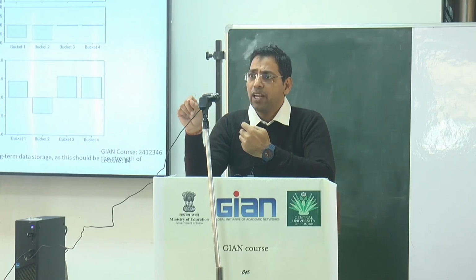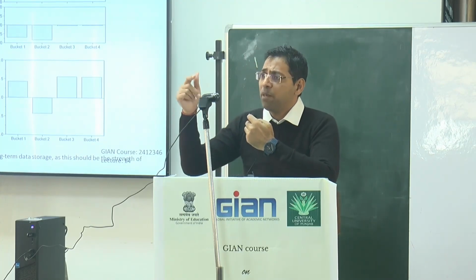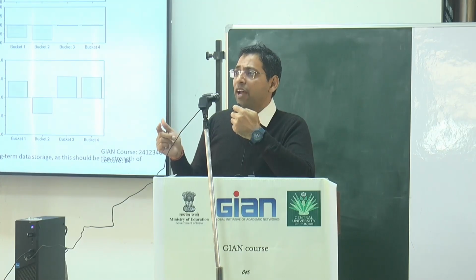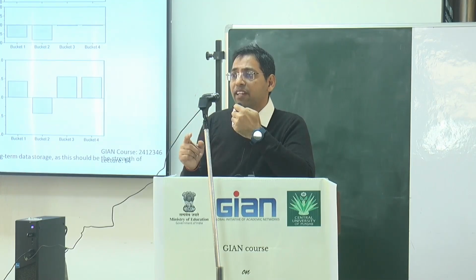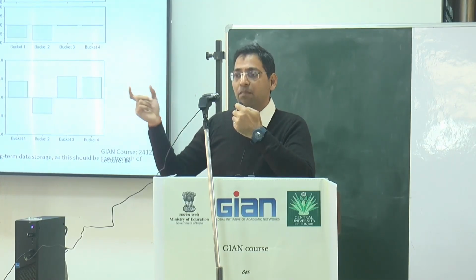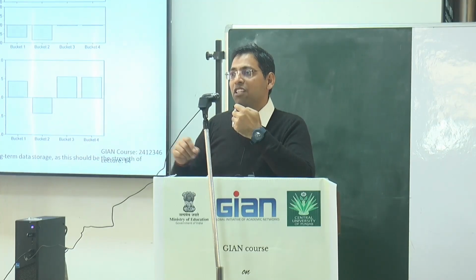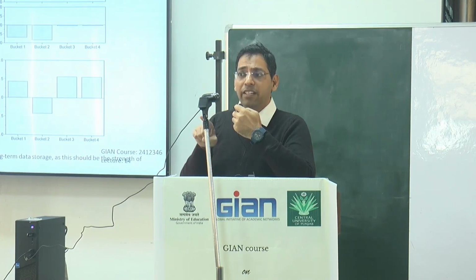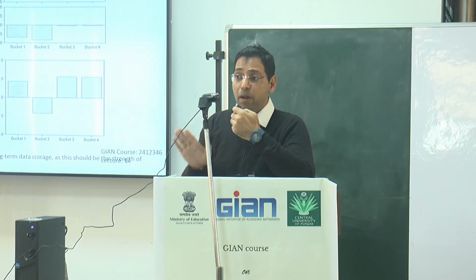So you know a little bit of change in the pH influences it: one peak was missing at 4.5. When you shift from 4.5 to 4.1 pH, the peak comes up, and the peak that was present previously was absent in this case. So a little bit of change of the pH can influence the spectra so much.